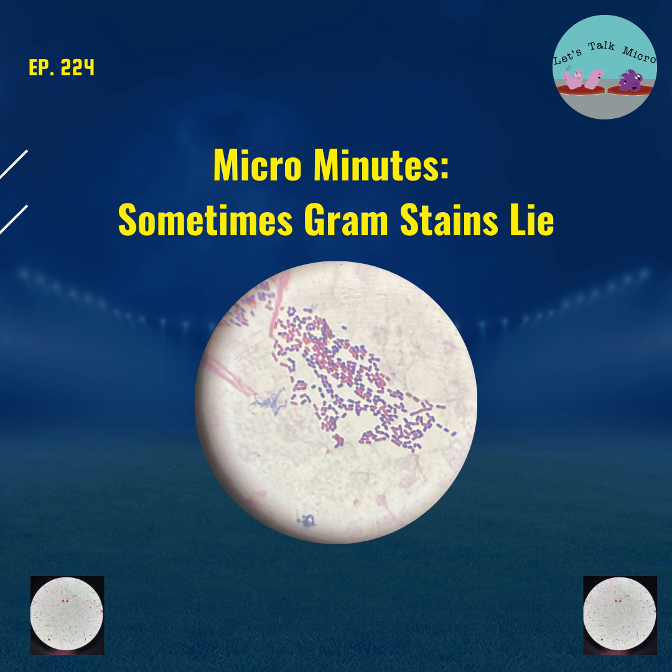One fundamental thing about Gram stains is that the organisms stain a certain way based on the properties of their cell wall. Gram positives have a thick peptidoglycan layer, which retains the primary stain, the crystal violet.